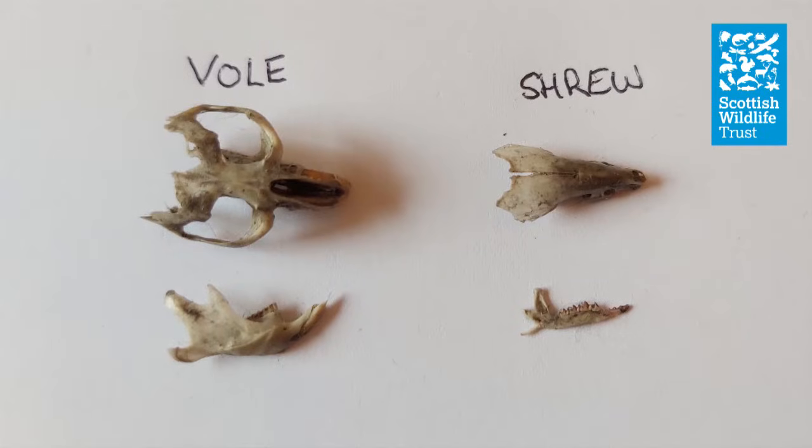If you want to identify what your owl has been eating, the best place to start is with the skulls. The most likely animals you'll find in a pellet are voles, mice and shrews, so we'll have a look at how to identify each of those.